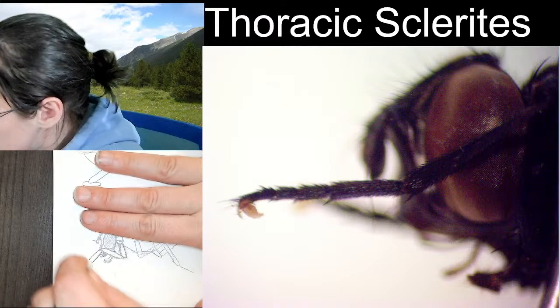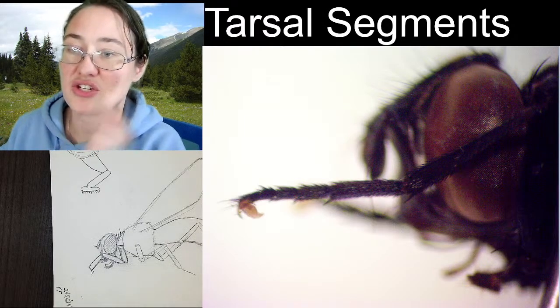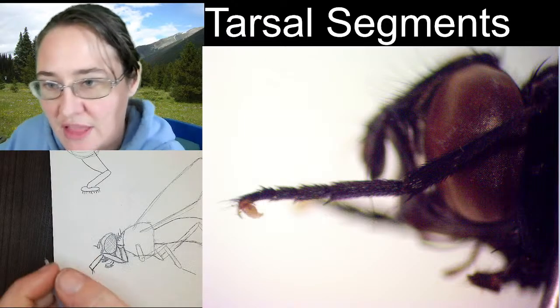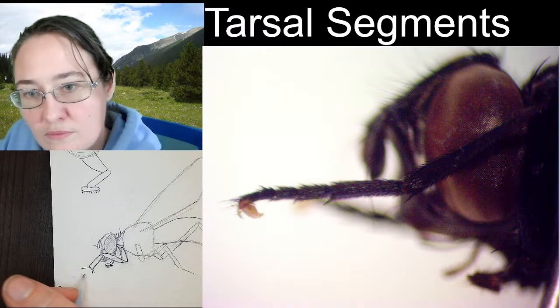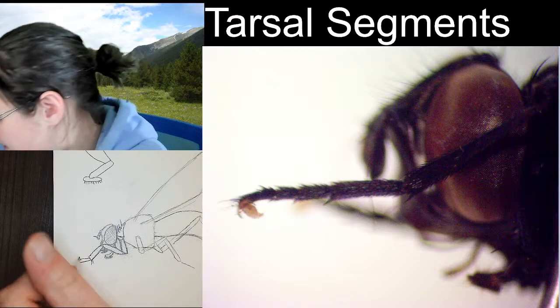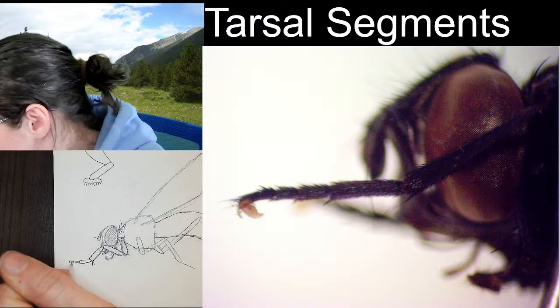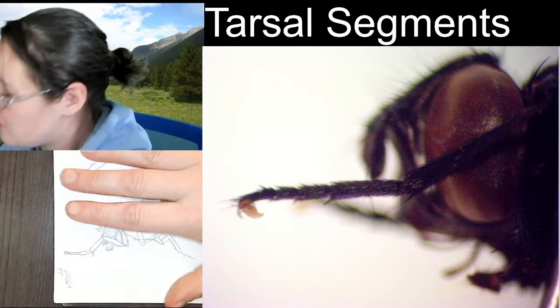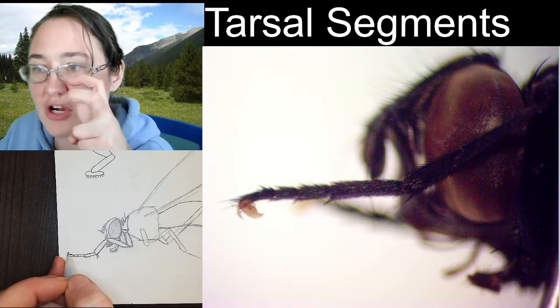And now we get those tarsal segments. The tarsal segments are essentially the fly's toe segments. One, two, three, four. He appears to have four tarsal segments on the front leg. The first one is about 3/4 of the length of the tibia. The second segment is half of the first. The third segment is just shorter than the second, so each one gets smaller and smaller. Then the last segment, we're going to call it a raindrop shape, narrow at the base, round at the end. I'm going to make the first segment narrower. It also has two tarsal claws and a pulvillus.